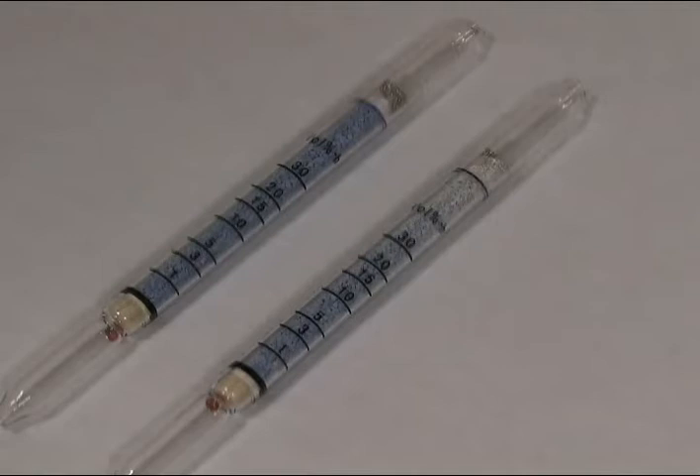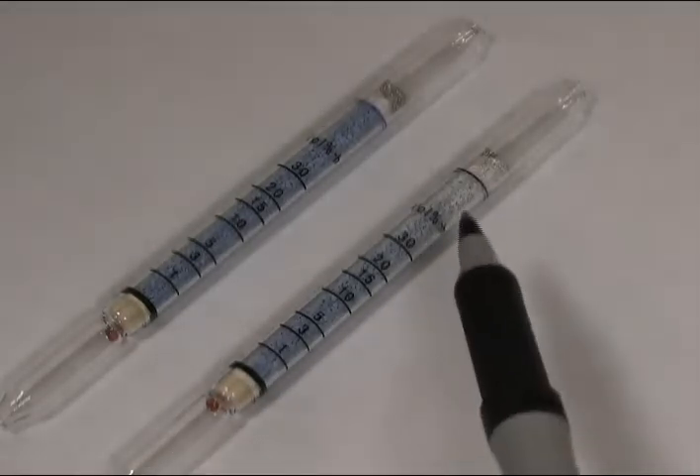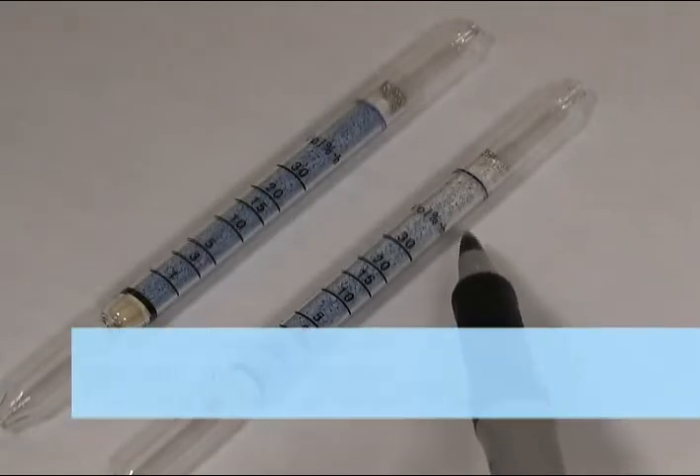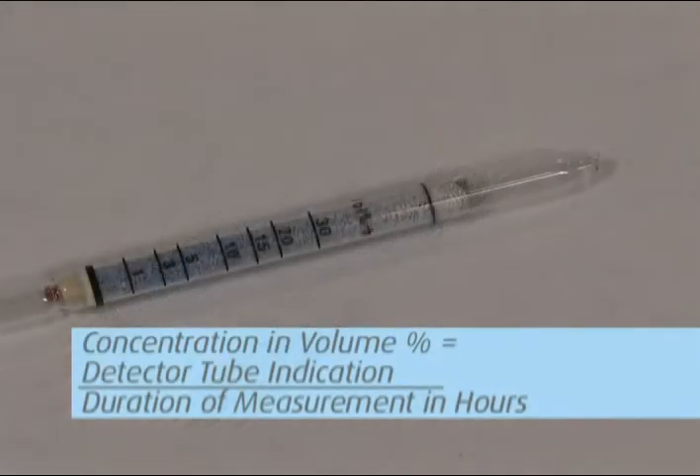To determine the exposure, visually determine where the color change is on the tube's marked concentration scale and record. To convert the tube reading according to the concentration in volume percent, divide the tube reading by the actual number of hours sampled.